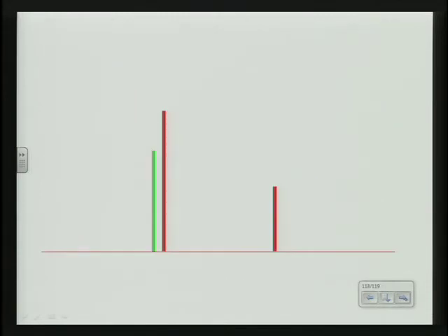And here again, even at D5, if you've got something where it's a 1-to-1, but you've got absolutely no representation at FGA, the major component's completely dropped out. So we just wanted to throw that up there. There's been some questions, some discussion about it, so we wanted to throw that up there. It's just a quick discussion point.